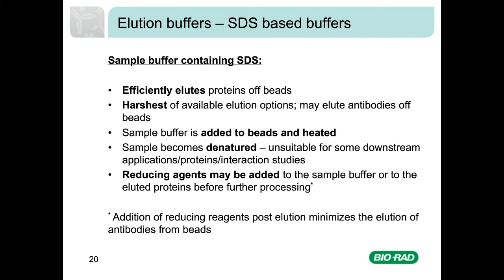As SDS-based buffers are denaturing, these buffers may not be suitable for some downstream applications. The sample is also heat-treated, generally by heating it to 70 degrees C for approximately 10 minutes during the elution process, rendering this method unsuitable for studying some protein-protein interactions.